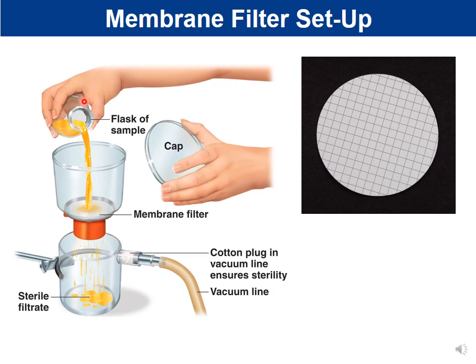So you could test bottled water, for example. You could test sink water. You could test water from a dispenser. Some people like to test their Hydro Flask water. Basically, the sky's the limit with what you can test. You could test Huntington Harbor water. You could test any sample that you want.